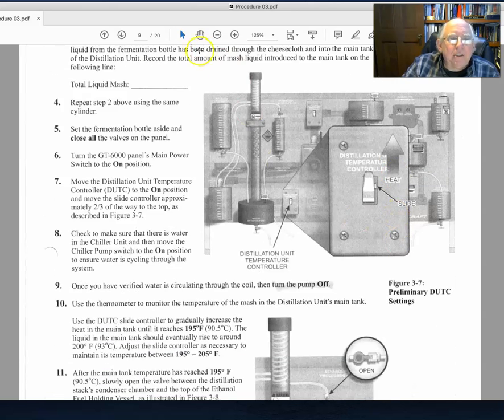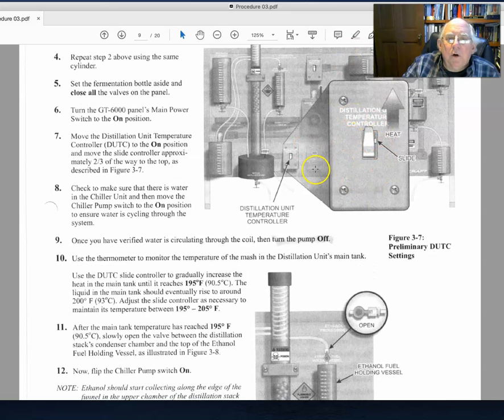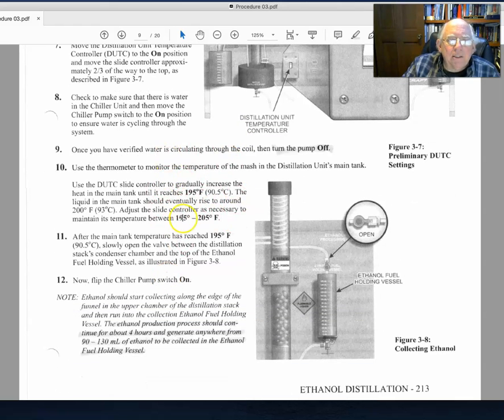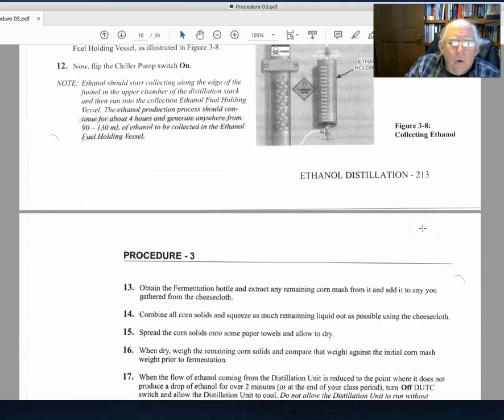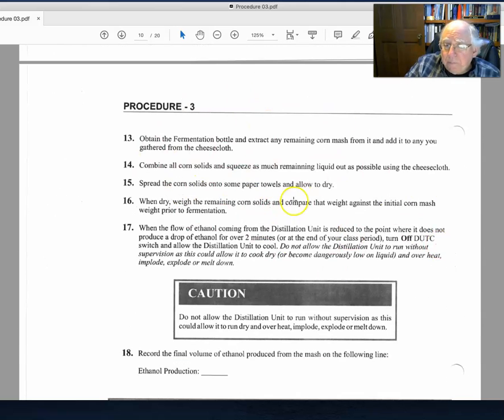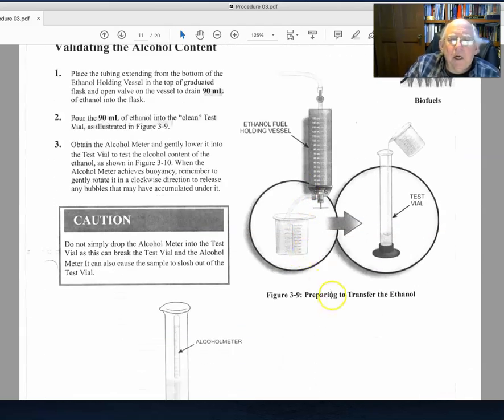The distillation process—I'll talk to you more about in the next couple of videos—but in essence we just turn the system on. The system has a controller to maintain the temperature within the boiler at a certain point. We watch that during the process and make sure that it does not exceed 205 degrees Fahrenheit. Over a period of time, usually it takes three to four hours, one will start to eventually see droplets showing up on the cooling coils as ethanol is eventually brought out of the liquid and forms its own liquid in the holding vessel there.